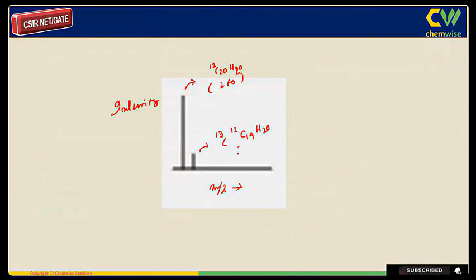So here we have mass 261. Look at the ratio, it is basically 5:1. If this becomes 5, this is going to be 1. The software is predicting the same thing that we are getting. From that point of view, the software is very good, and everyone is habituated with this software.